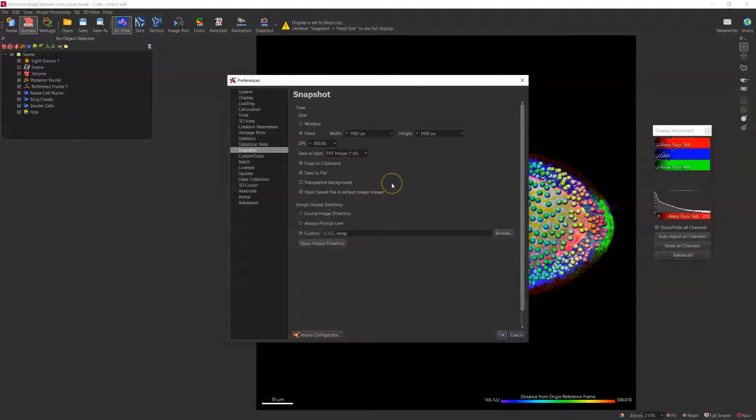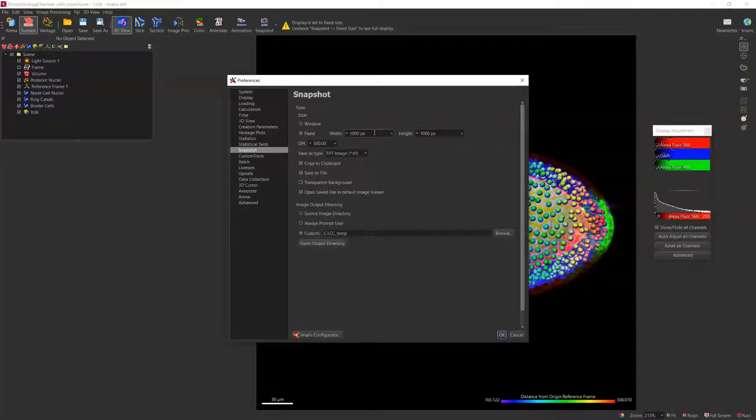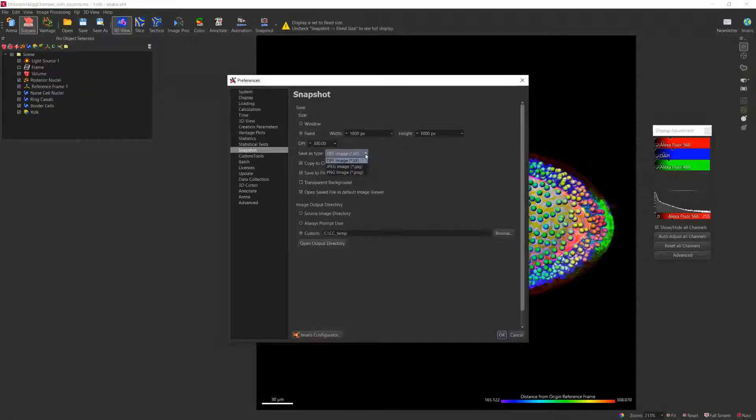You can choose to either save the output file the same as window size or with specific fixed size in terms of pixels. You can also choose to save the image in TIFF, JPEG, or PNG format.